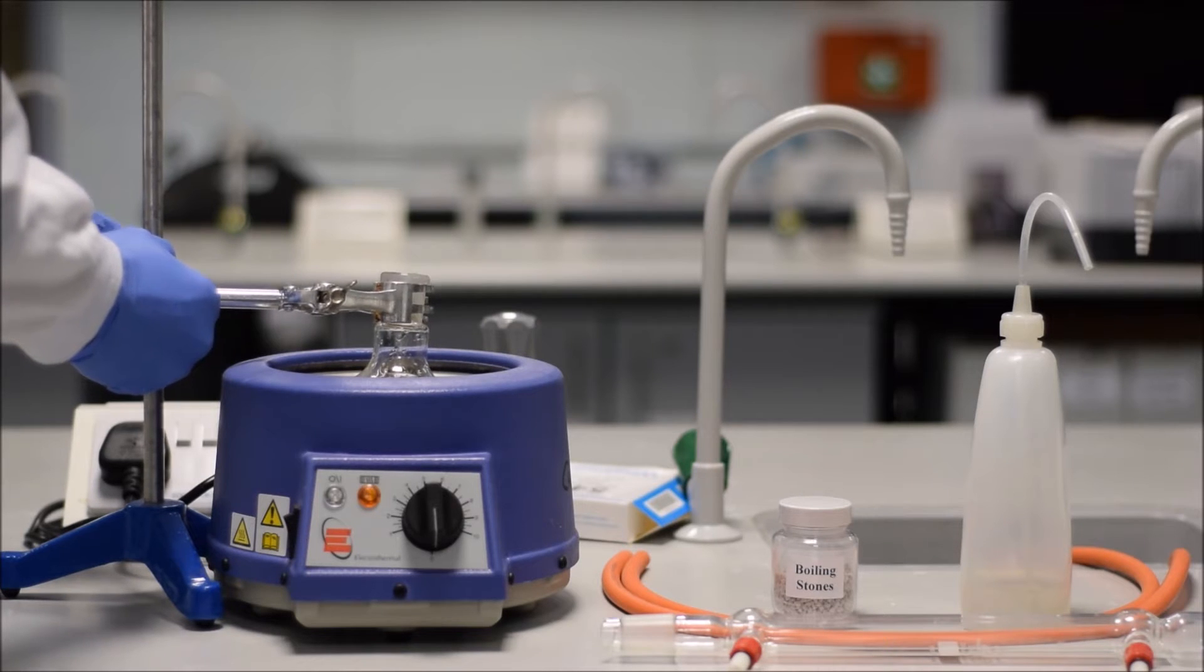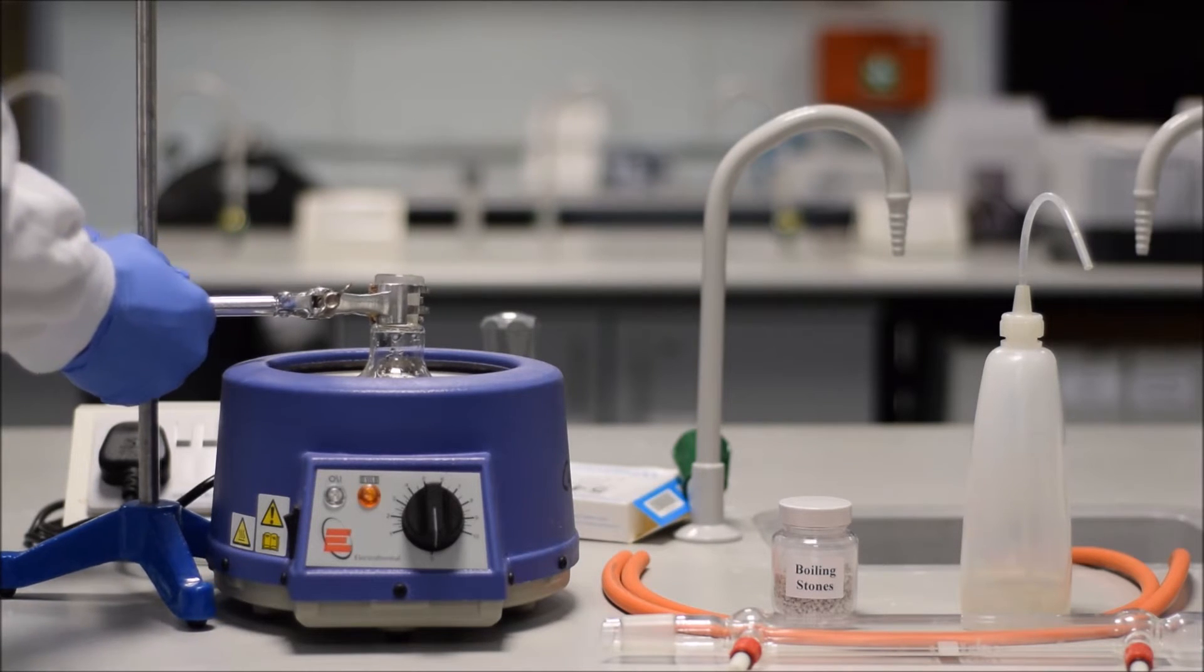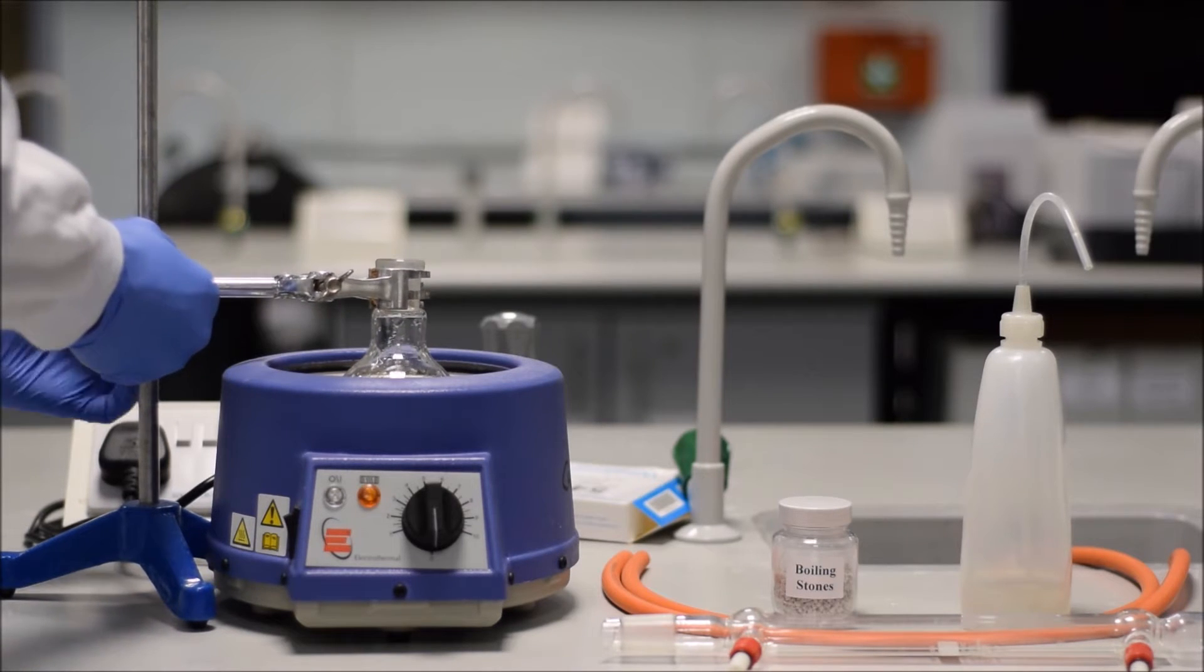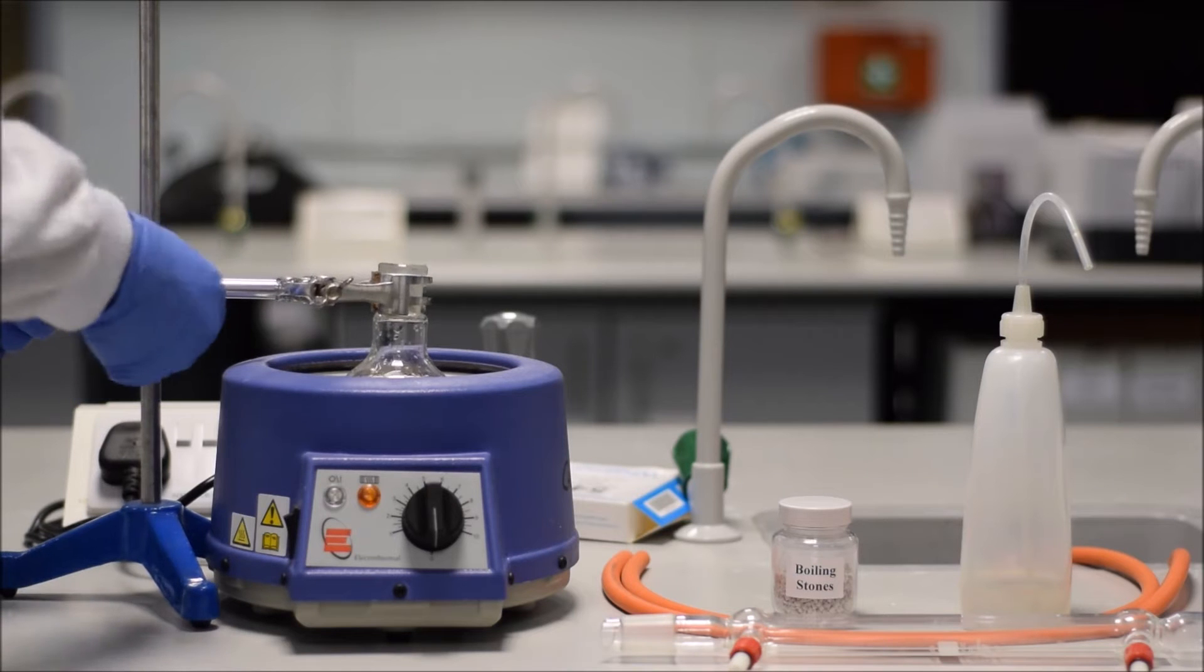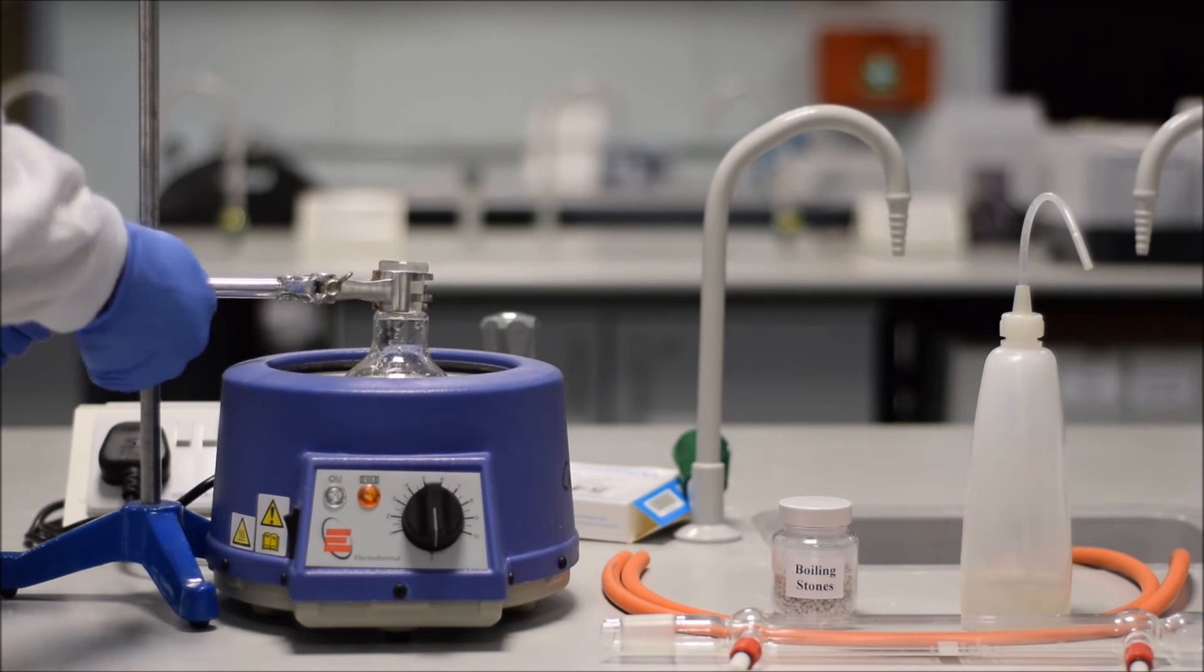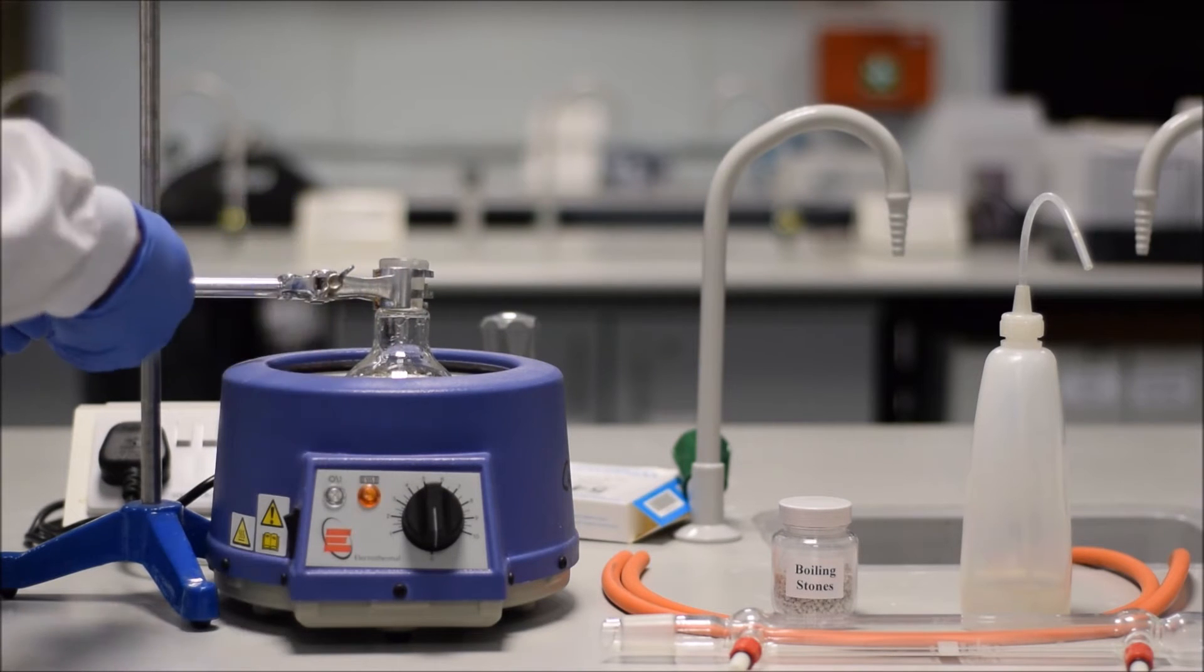Next, lower your flask into position. It's important that the heating mantle is cold at this point. You don't want to heat it up before you've got the condenser in, otherwise reagents and solvent are going to evaporate into the lab, and that's going to be hazardous for you and for others. So clamp it securely, following the same method that we always follow.